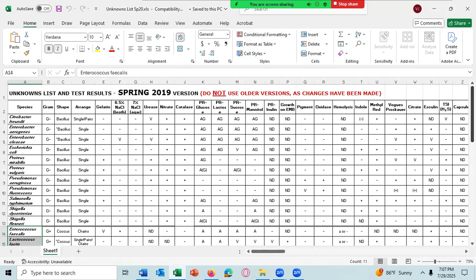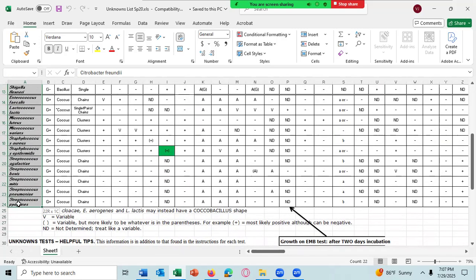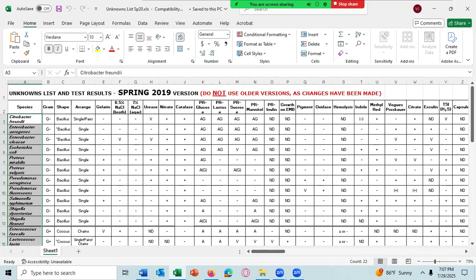What I'm going to do is send you a number, and the number will stand for one of these species. Then for the rest of the term, you're going to be doing tests trying to identify which species your number is. Initially, I'll be sending you 2 or 3 tests, which I will choose just to get the project running.